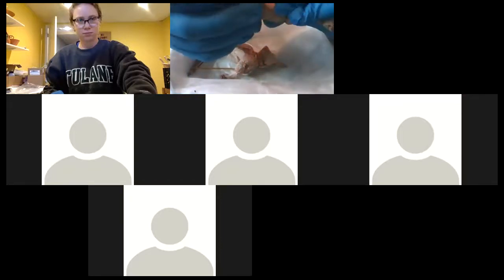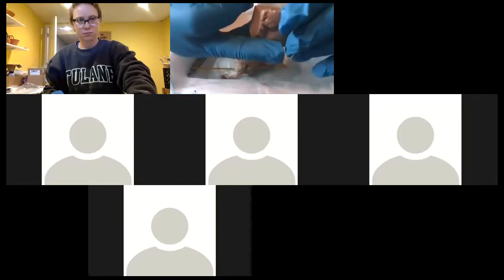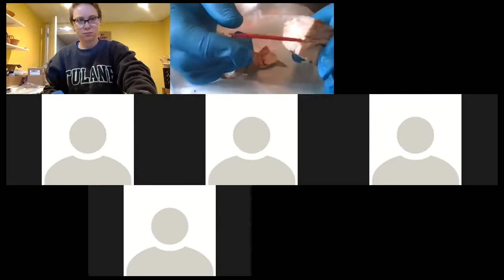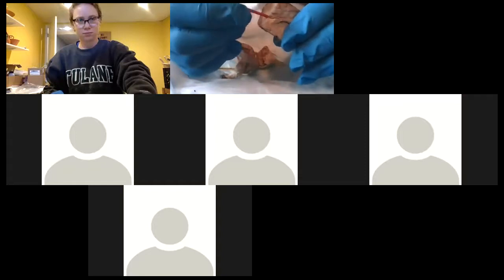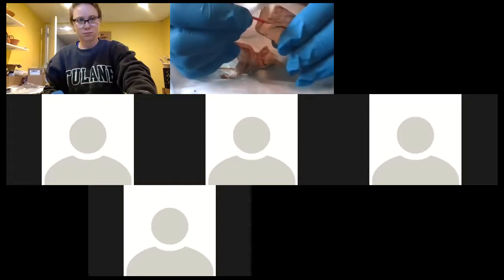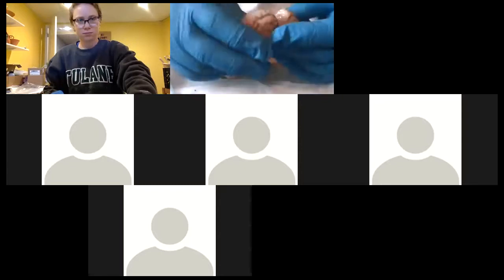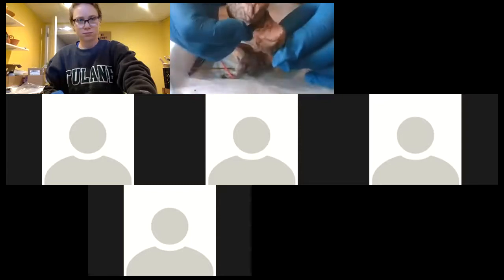You can see part of the corpus callosum. This is where the ventricle would be. You can see the lateral ventricle, which is separated by the septum pellucidum, which is gone, basically. You can't really see that. Don't forget to open up the back like this.